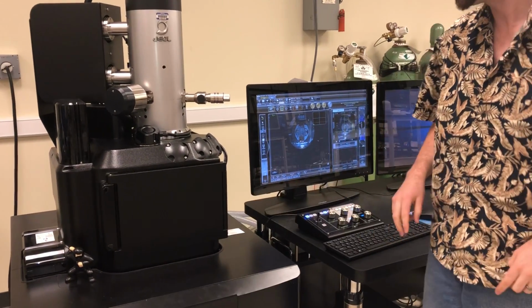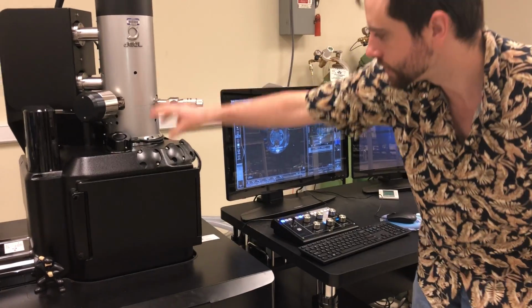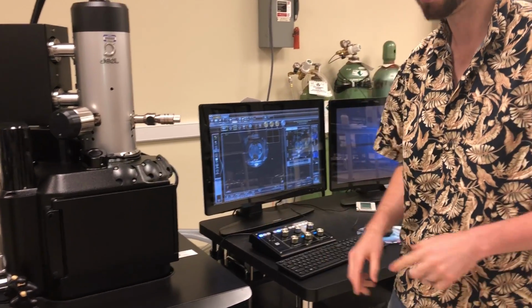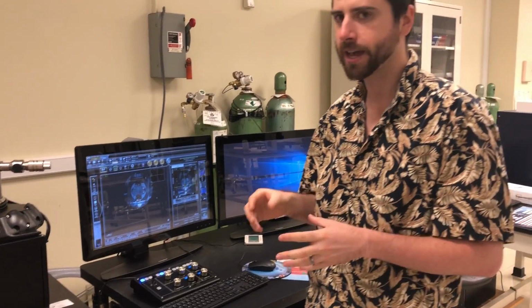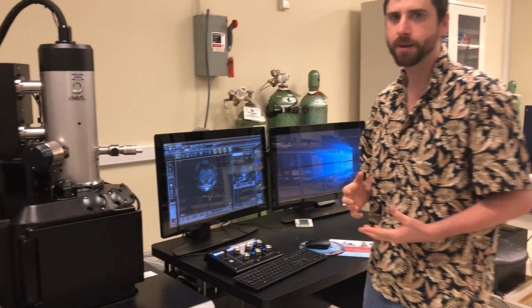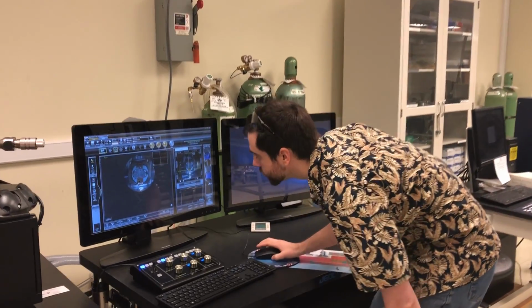tin sponge that was made with the tin sponge experiment. When the electrons hit that sponge, they're going to kick out parts of the sample, knock electrons out of the tin atoms, and those electrons that are knocked out, we're going to collect them and use that to make a picture.